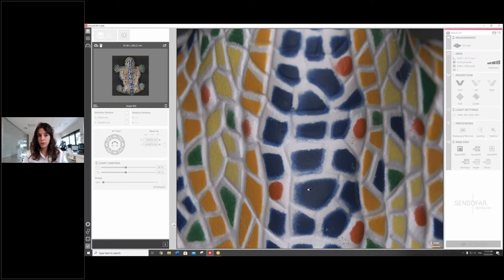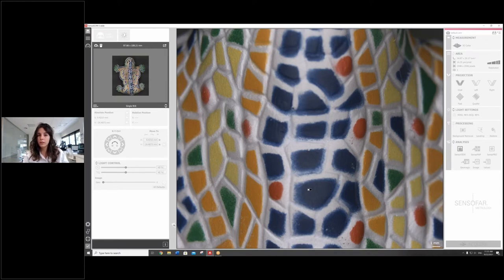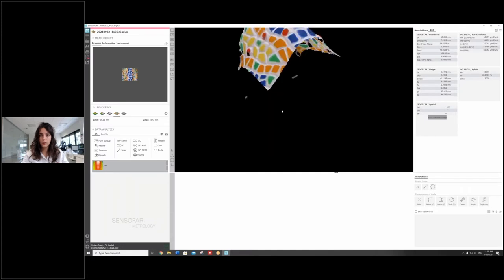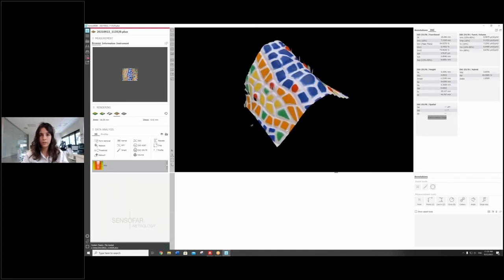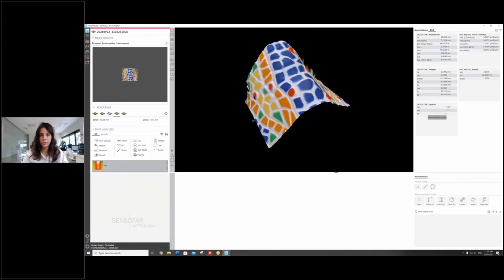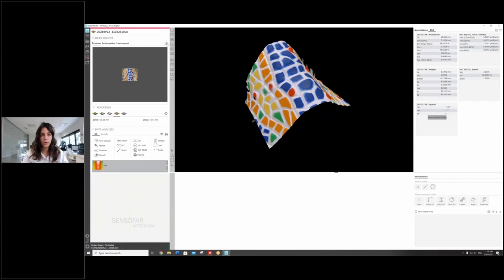And this sample is actually going to benefit quite a lot from the color camera that DS White has. So this is the result. Looks pretty nice. This is the 3D. This is the 2D view.